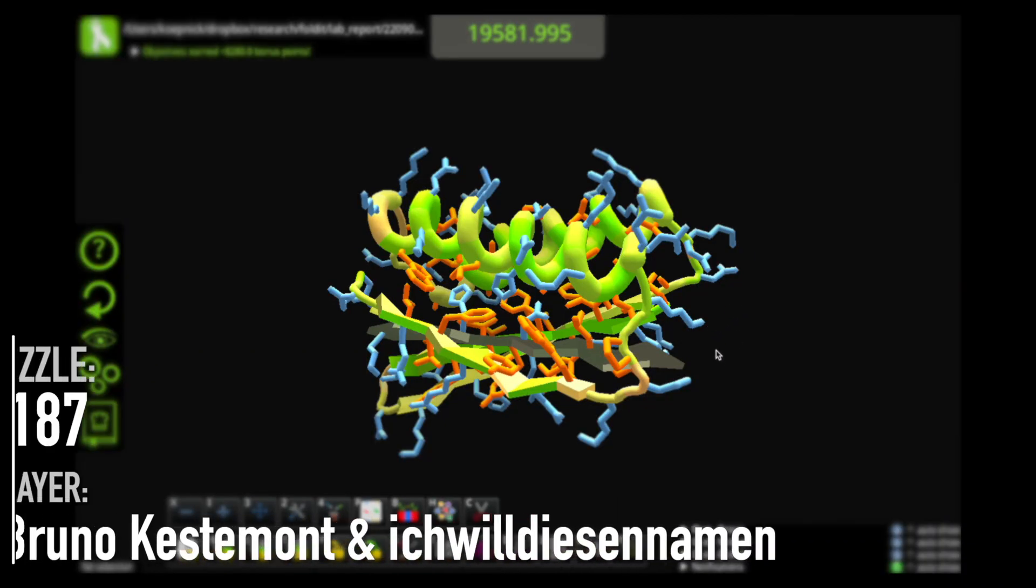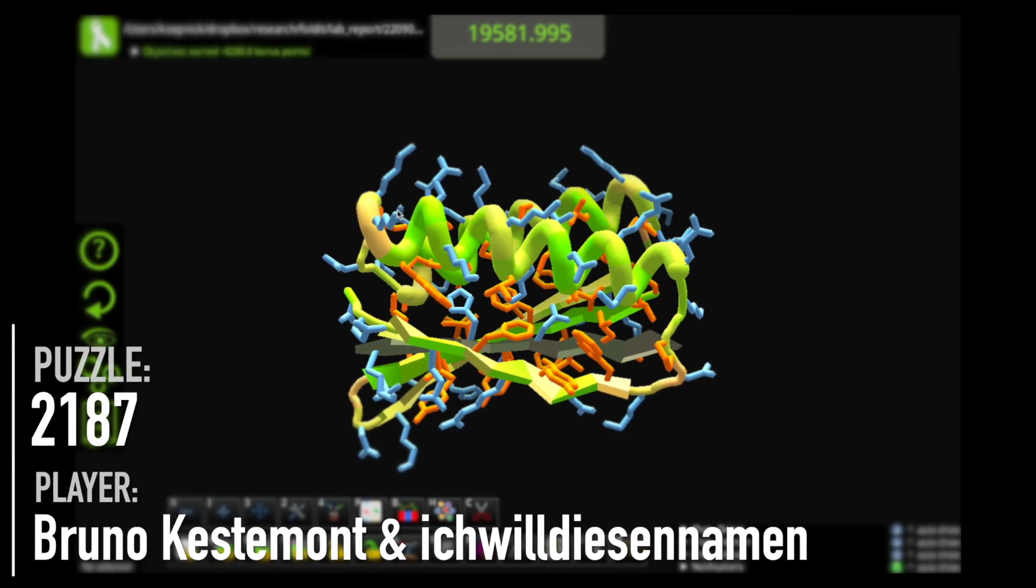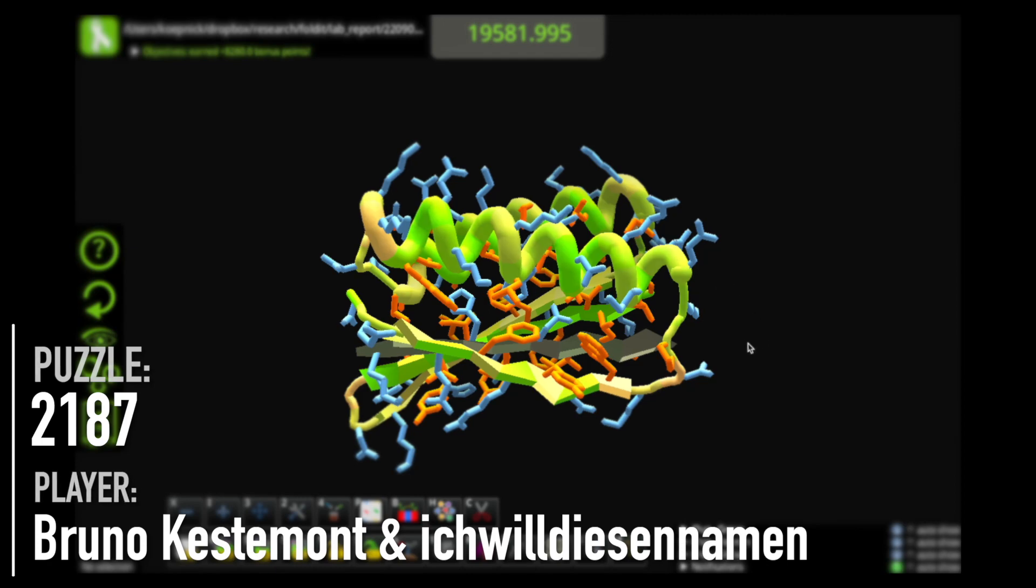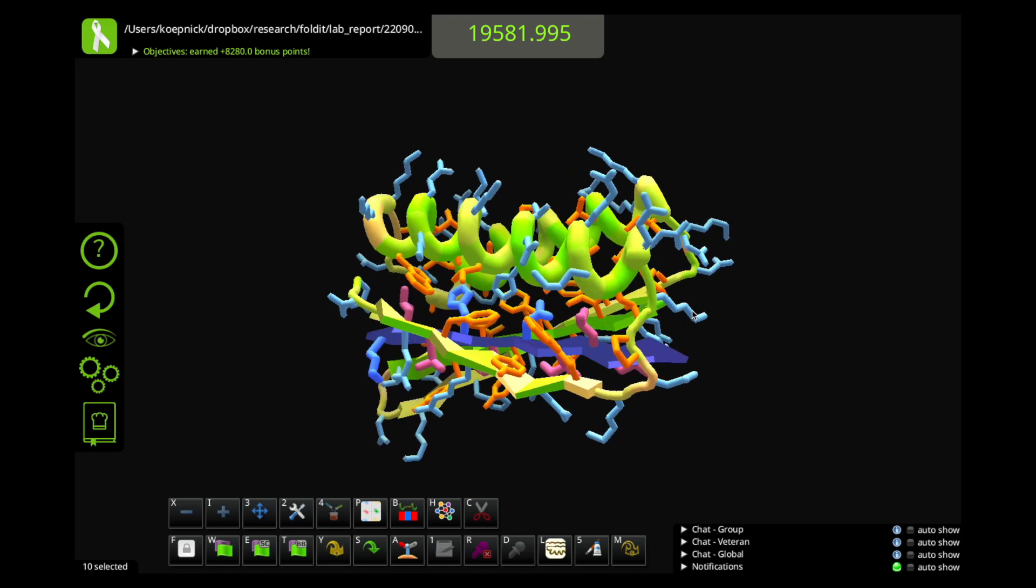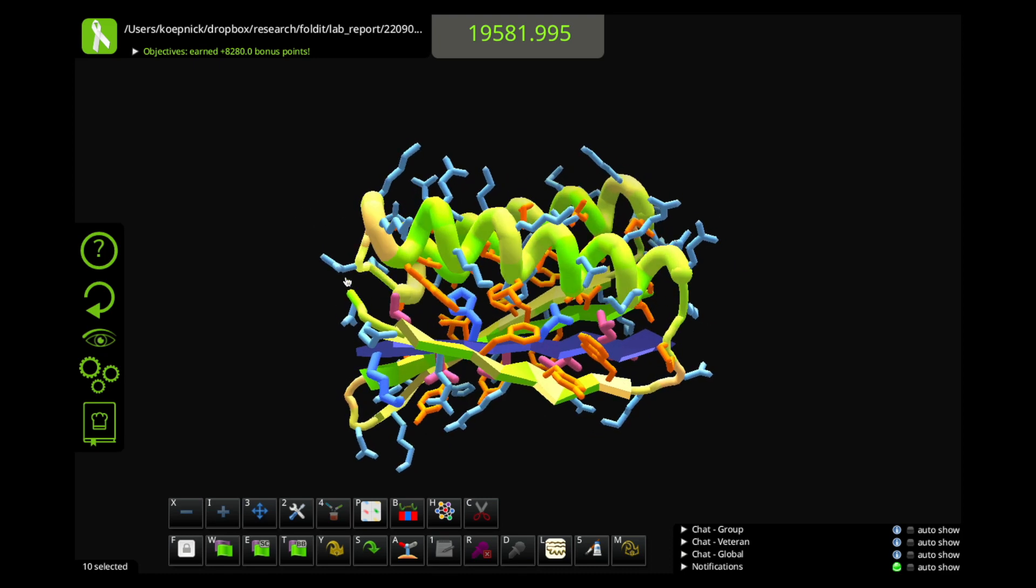And that brings us to the design of the month. We have a strand binder design by Bruno Kestemont and ichwilldiesennamen. This is from puzzle 2187. Now this binder design puzzle is different from normal binder design because in this puzzle we have control over the sequence of the target. We can redesign this target strand to be any sequence that we like. And this will be mostly important for lab experiments where we want to bring two proteins of interest together. We can tether one to our strand here, and we can tether the other to our binder. And if we mix those in solution, then we can be certain that this binding association will bring our proteins of interest together.